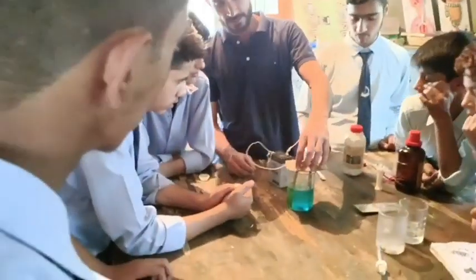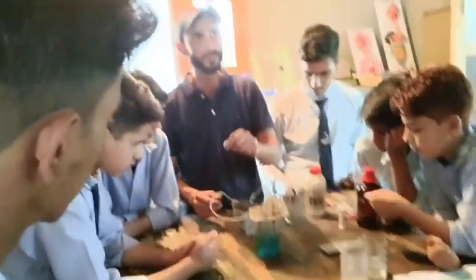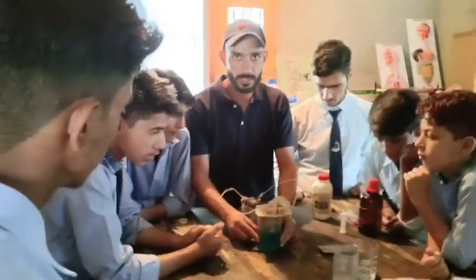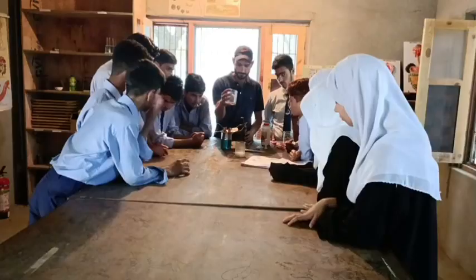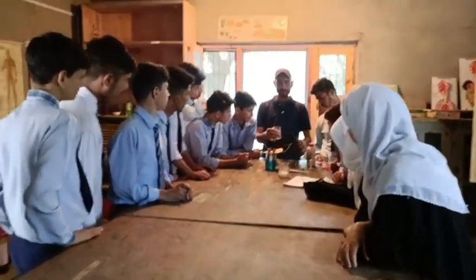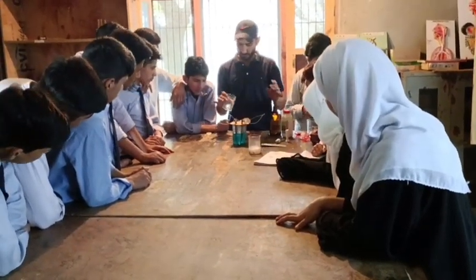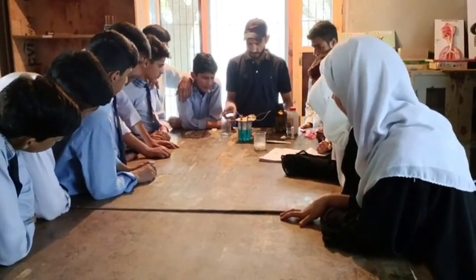I will add some hydrochloric acid to this solution to make sure that the solution becomes more conducting. I have now added the hydrochloric acid.